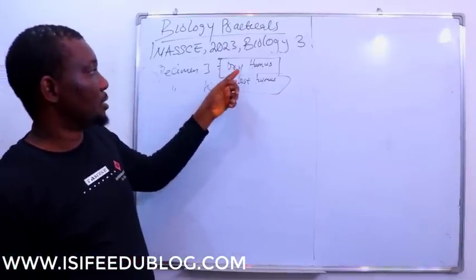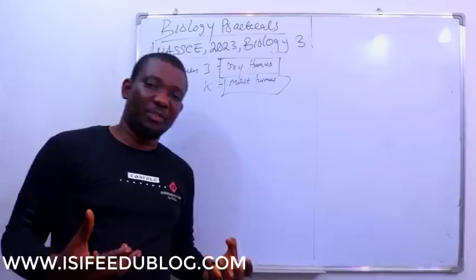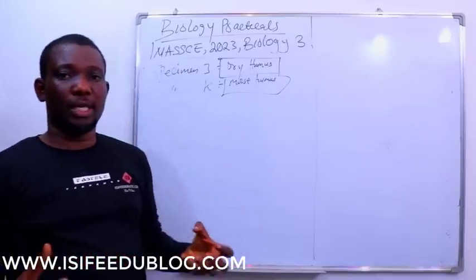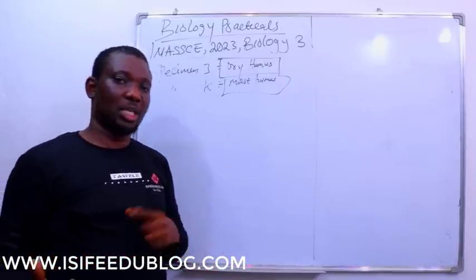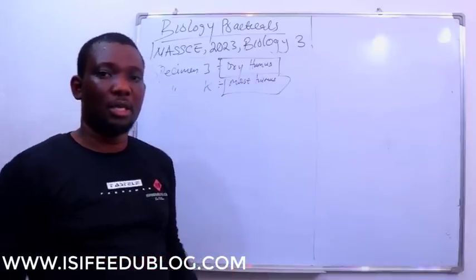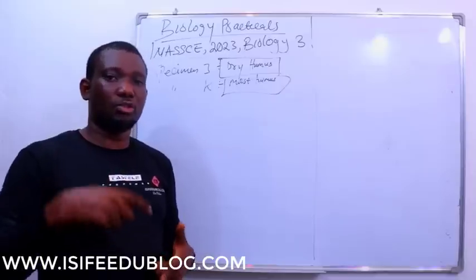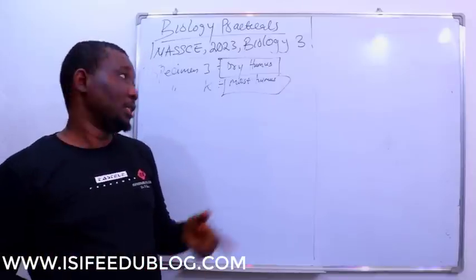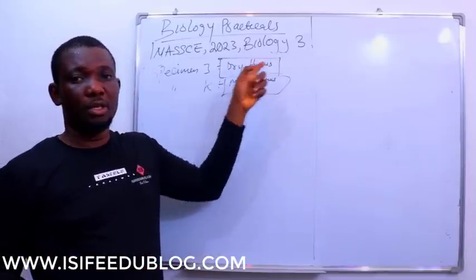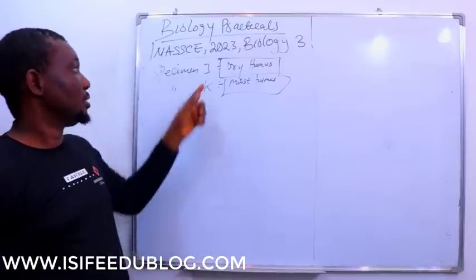Specimen J is rich in nutrients, but for the fact that there is no water in it, that is the disadvantage compared to specimen K. It has the nutrients, but the nutrients cannot have access to plants since the nutrients have to be in dissolved form. There is no presence of microorganisms here anymore because of the dryness of the specimen.